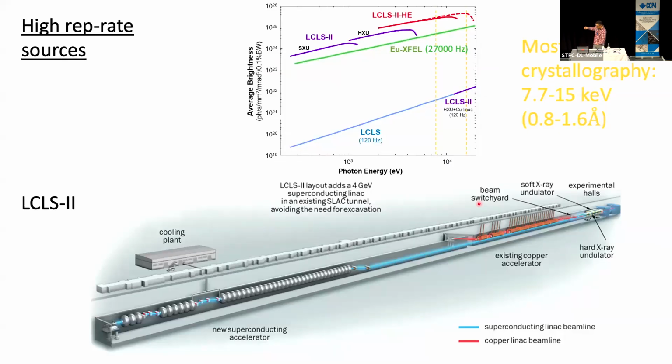Okay, so quickly now, I'll just show this picture of LCLS-II. You can see those superconducting cavities there at the bottom. And the undulator is just over here. All right, so LCLS-II is initially going to be just soft X-ray, but it's going to have a megahertz rep rate, and you're going to be able to use whichever pulses you want, is what they're saying.